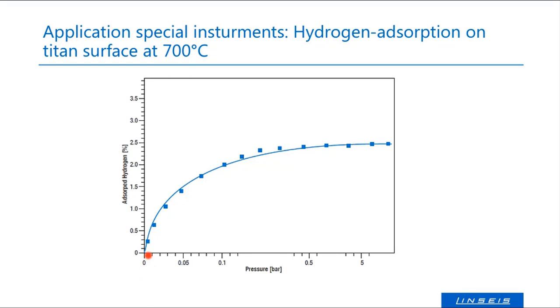And it was not only filled in, it was filled in under controlled pressure and pressure controllers. So we filled in a certain pressure and waited until the weight change was stable again. We noted the mass where the system stopped, then we increased the pressure. Again, we stopped the experiment when the mass change was stable, and then we did the next pressure and the next pressure and the next pressure.